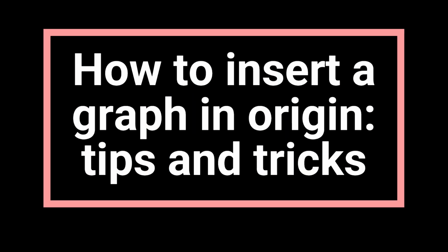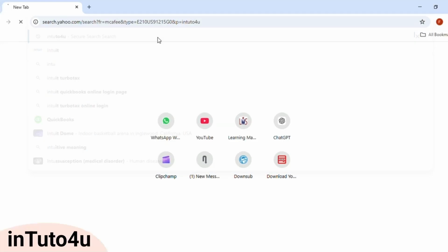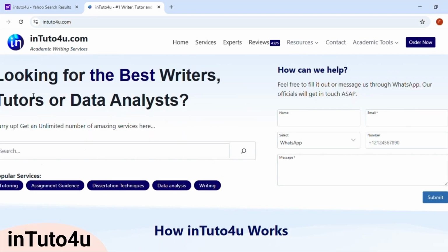How to insert a graph in Origin, tips and tricks. Welcome back. You're just in time for something awesome today. We learn about how to insert a graph in Origin.